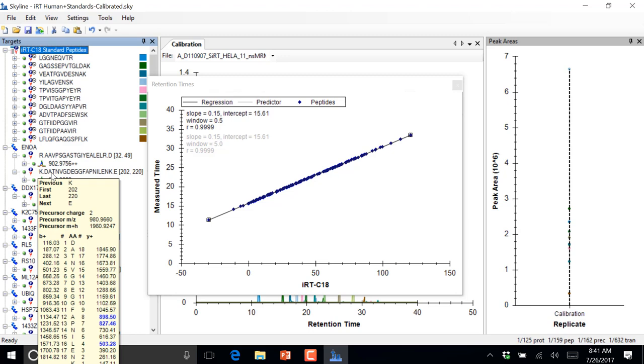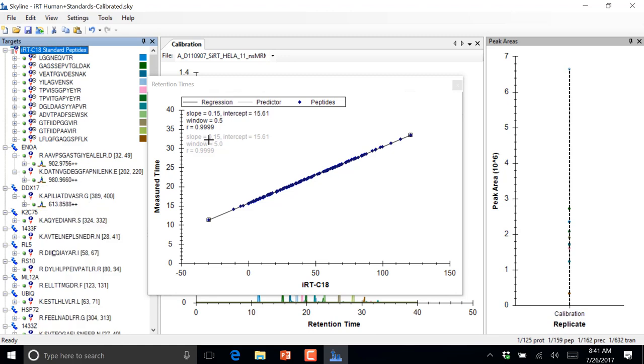So basically, if you had checked it, you would have known that when you export the transition, it's going to use the actual retention time, not the predicted. If we wanted to export a method right now, we could use the measured retention time. So if we wanted to export another 30-minute method, we could just do that because we have measurements for everything. So why use IRT prediction if we're staying on the same chromatography? We would just use the measured.